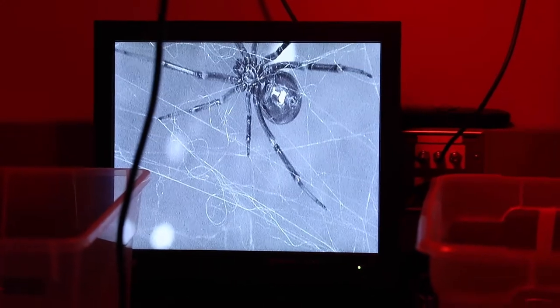This is my student Nishant and I setting up for some experiments. We have these cameras together with zoom lenses to focus in on these spiders which are fairly small because we need to see the details of the mating.